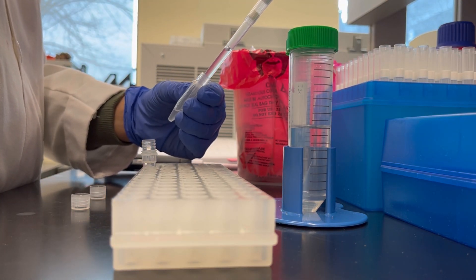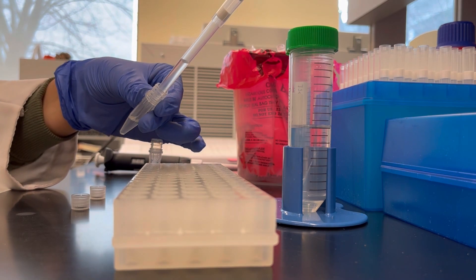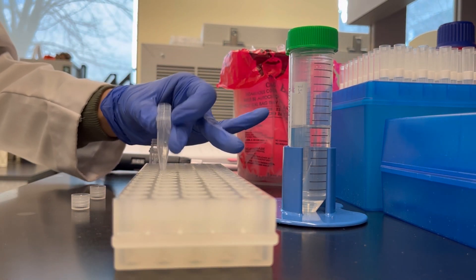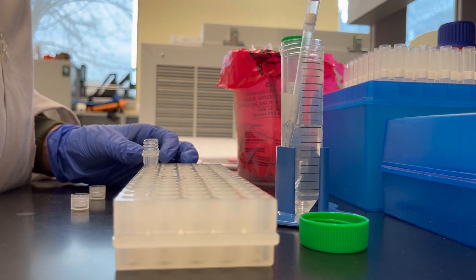For the second wash, discard the ethanol and repeat the previous step. Add ethanol, vortex, and centrifuge.